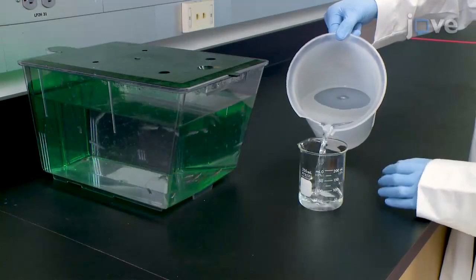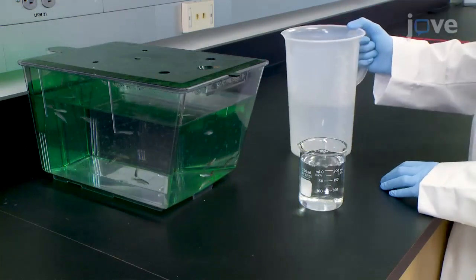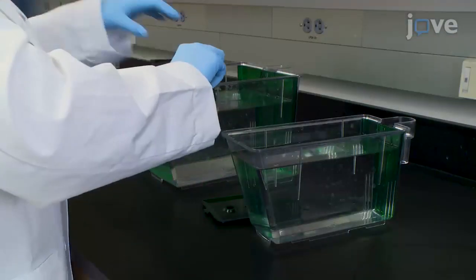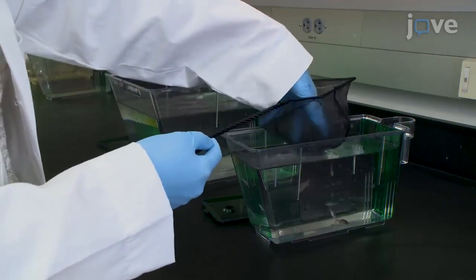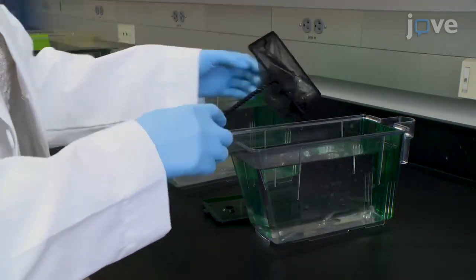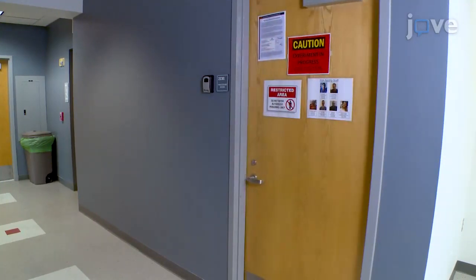Begin by filling a 250ml beaker and at least two holding tanks with fish system water. On the morning of the test, transfer at least 10 adult zebrafish for each experimental condition into individual holding tanks, before transferring all of the fish to the behavior room for acclimation for at least one hour.